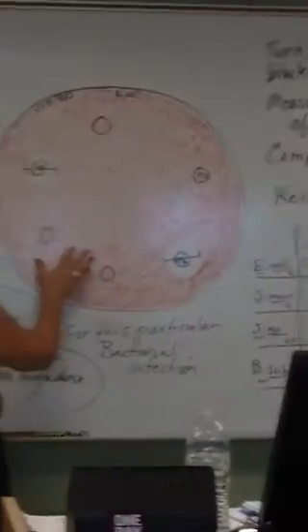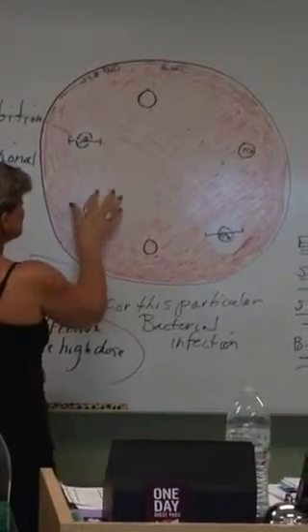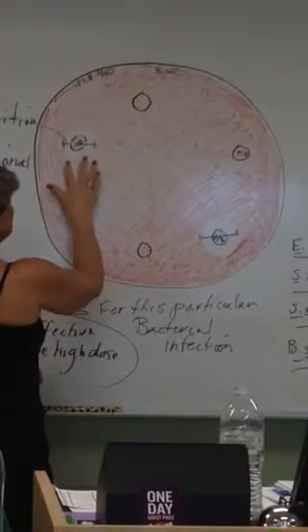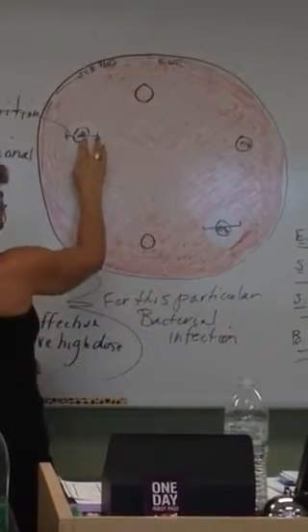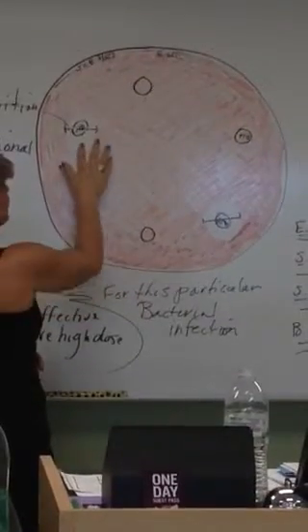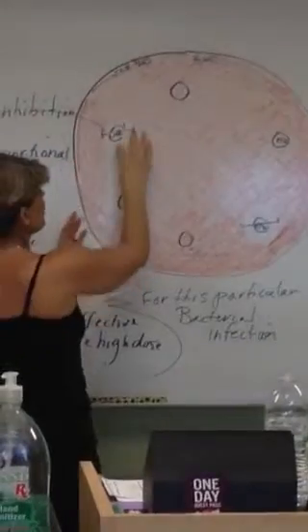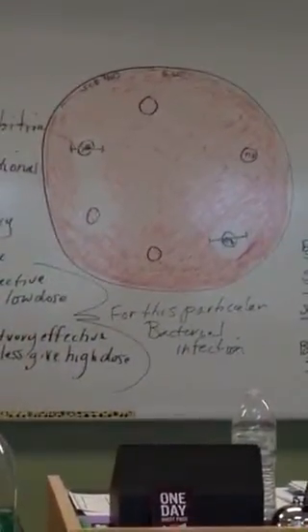Sometimes, remember, we showed synergistic effects in their PowerPoints, where you have one zone of inhibition here and another zone of inhibition here, perhaps. And then in between, it's clear also, because the effect of that enhances the effect of that, and so it even gets the ones in the middle. Outside of the zone of inhibition, they enhance each other's effect. That would be synergistic effects. You might get something like that.